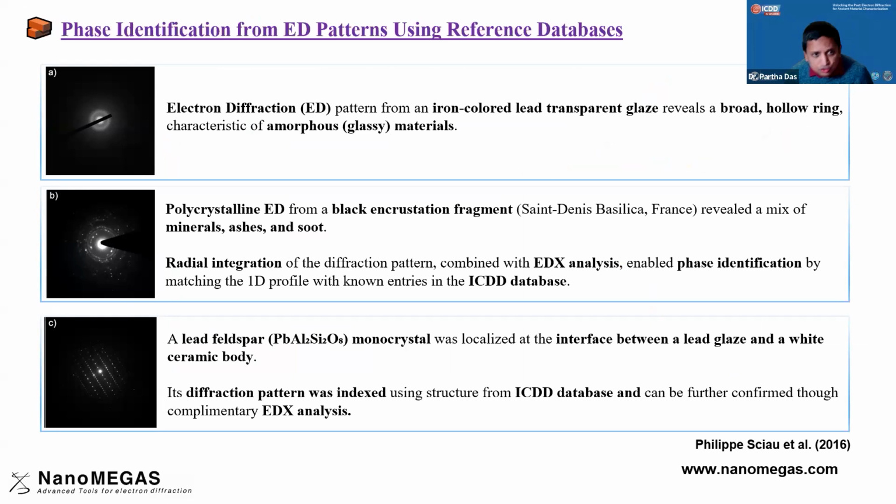Most of you are familiar with diffraction itself, so I'm not going into the details of what diffraction is, when diffraction happens, Bragg's law and everything. Let's see real life examples. These are some of the examples I have taken from a review from Philip Seo. He has done some excellent work using imaging and diffraction.